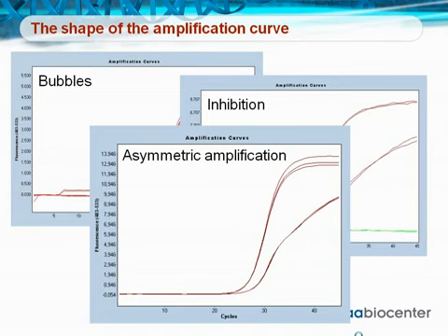Normally, if you have made a common master mix, all your samples will show this behavior. If the amplification curve has normal shape in the beginning, where the Cq value is determined, the quantification will not be disturbed, and the curve can be used.